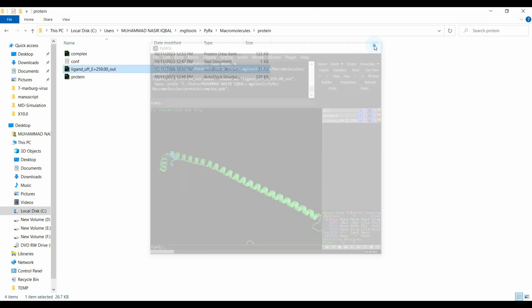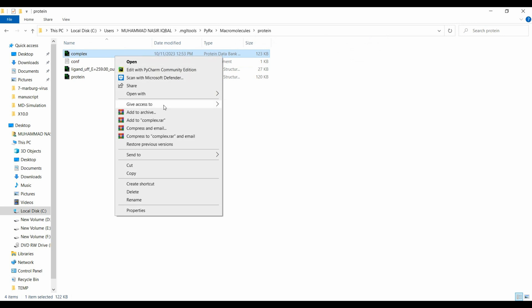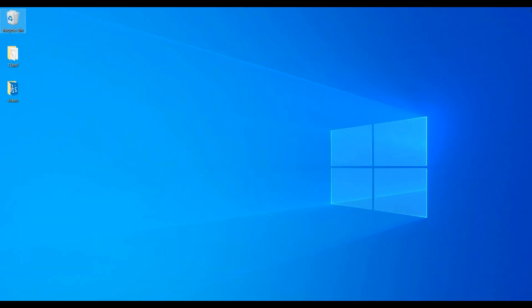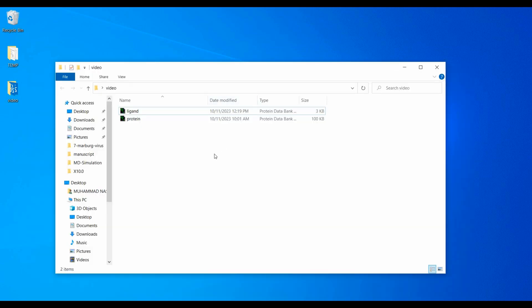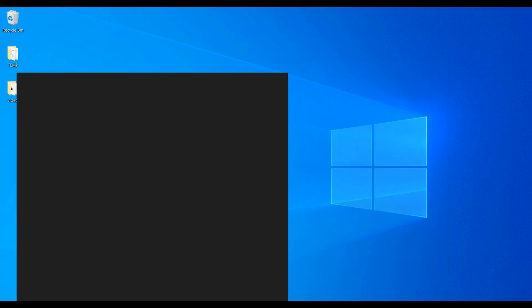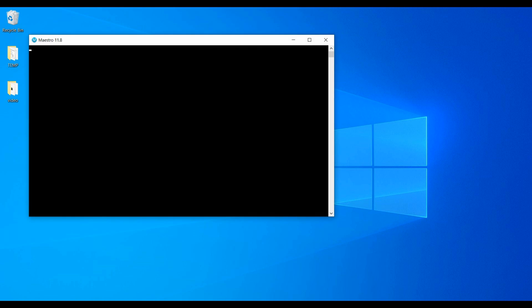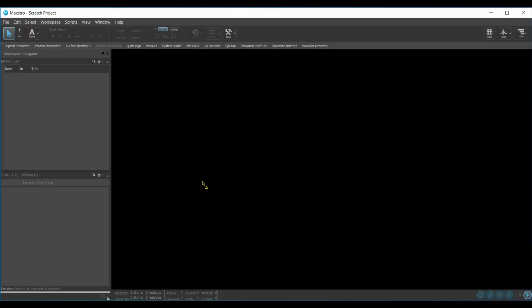Now we move toward molecular dynamics simulation. I have placed the complex and for MD simulation we use Desmond, which is a package of Schrödinger. Maestro is the graphical user interface through which we command Desmond to perform molecular dynamics simulation.